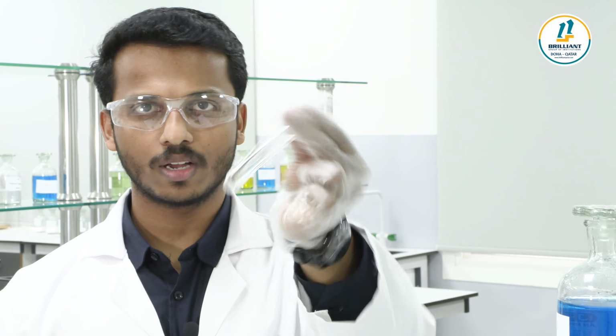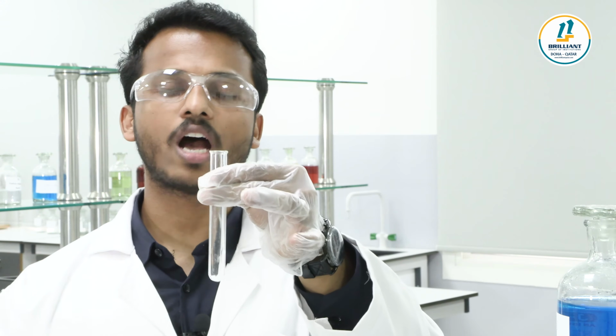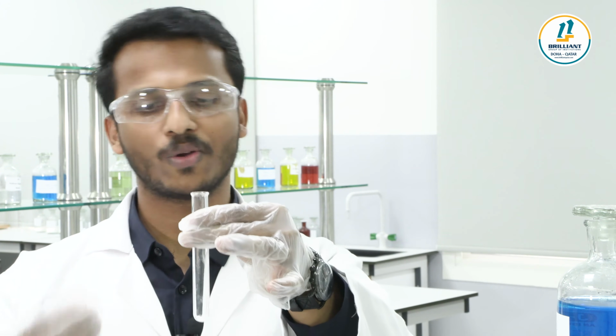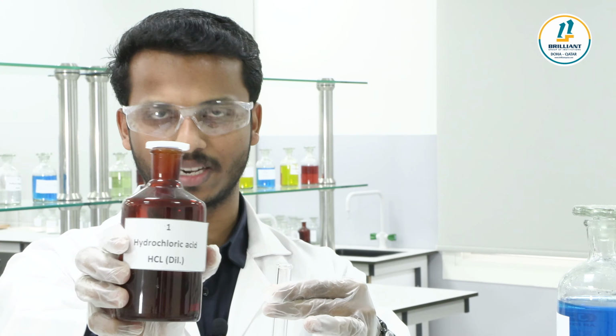To this test tube I'm going to add the given salt. A colorless salt is provided. I'm going to add a pinch of salt, a very small amount, with a spatula. If you're doing the carbonate test, you can do the experiment either with the given salt directly or make it into a solution. To this salt I'm going to add dilute hydrochloric acid.